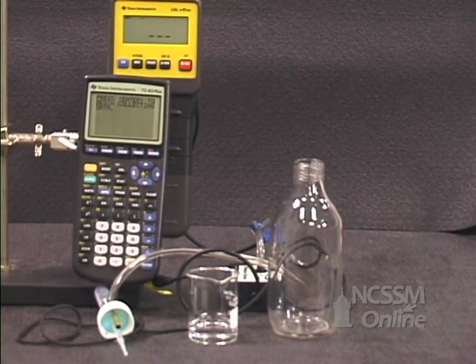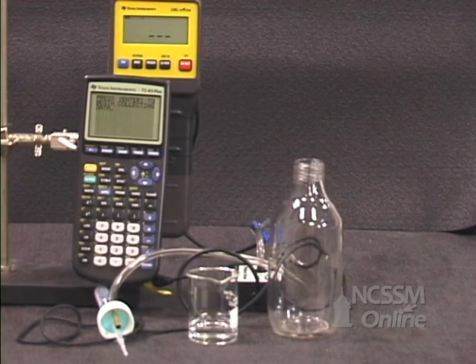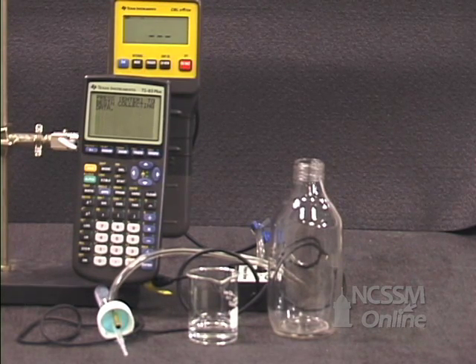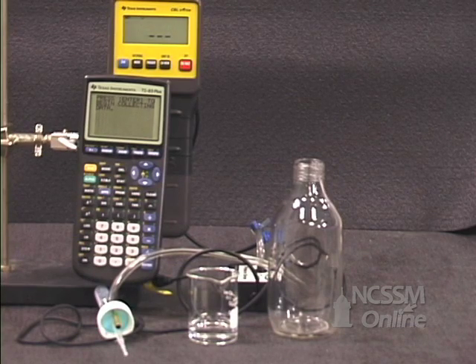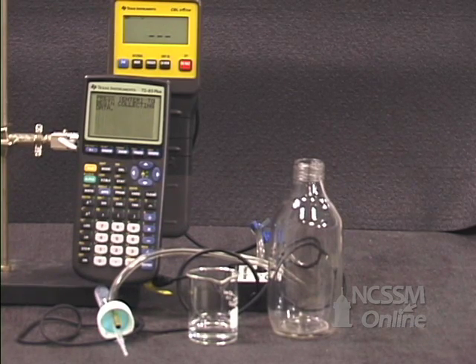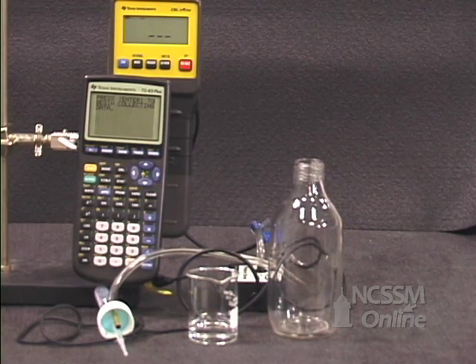We will do an experiment to measure the vapor pressure of methanol at different temperatures. We have connected a pressure sensor to our CBL and the CBL to the calculator. I've already loaded and started the ChemBio program and set it to measure the pressure every 3 seconds for 40 samples.